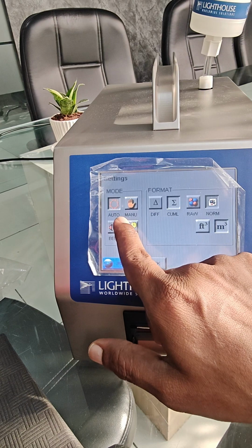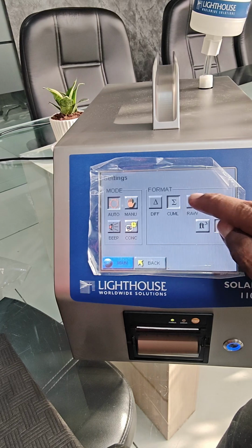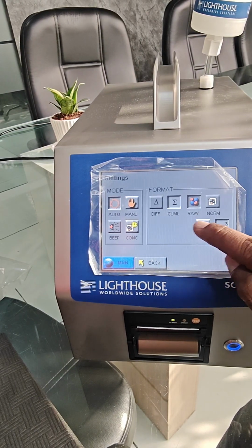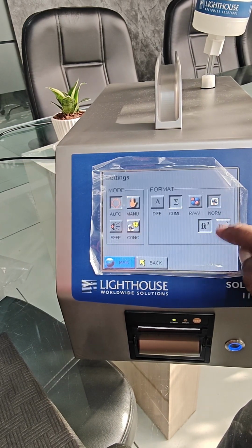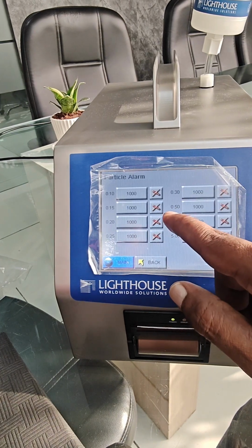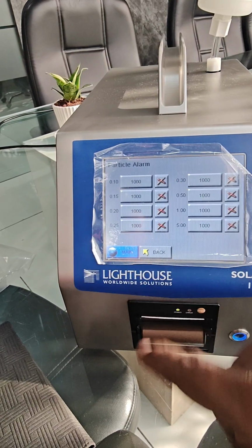This is manual, auto, concentration, beep mode. This is cumulative, differential, raw counts, normalized count. If you select raw counts, it will not show this or this. If you select normalized count, it will have option of feet cube and meter cube. If you have to set some alarm limit, you can set a limit and enable it this way.